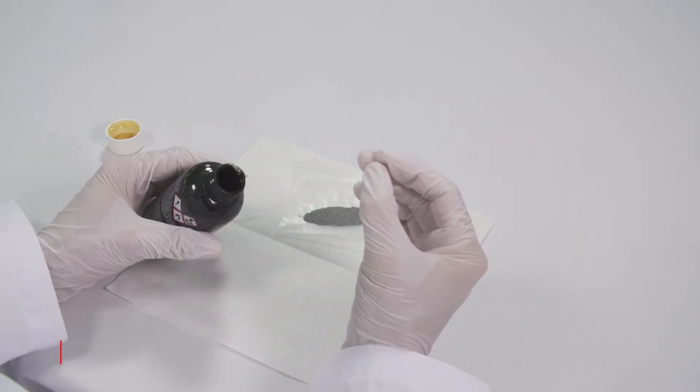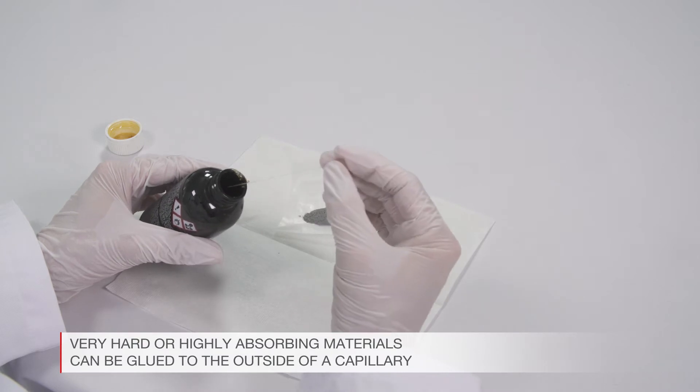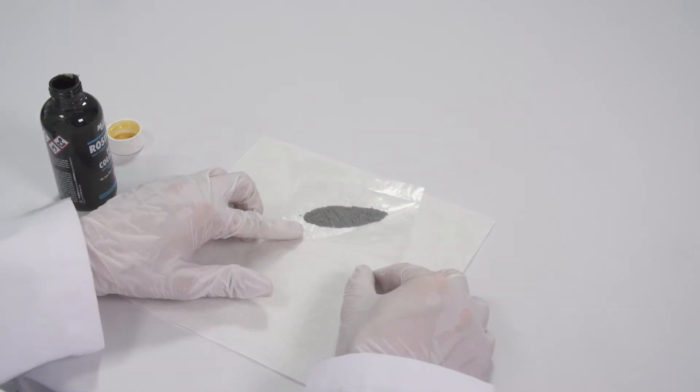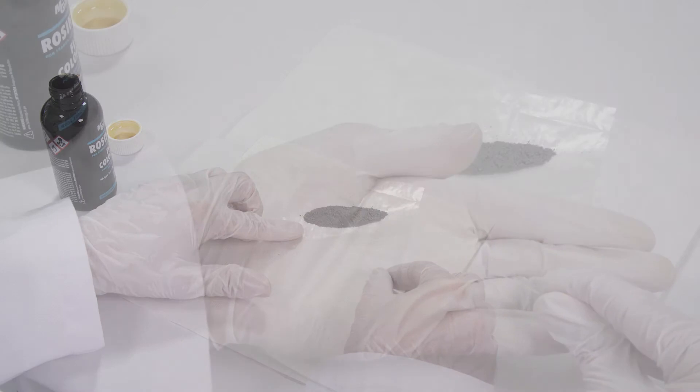Very hard or highly absorbing materials can be glued to the outside of a capillary to dilute the sample and get high-quality transmission data.